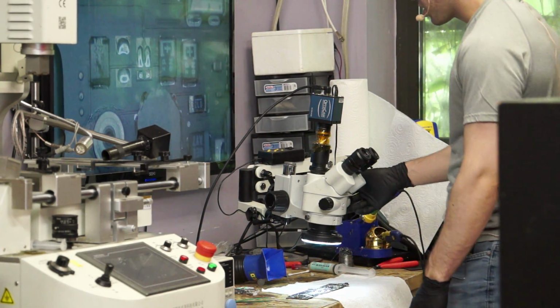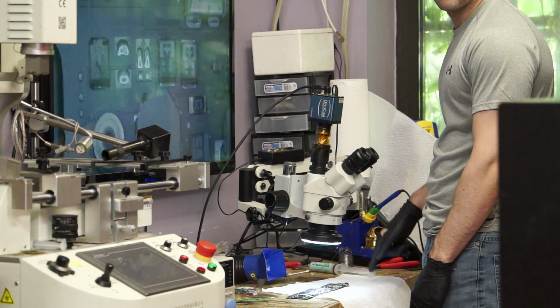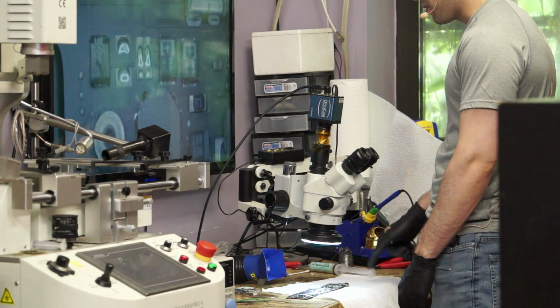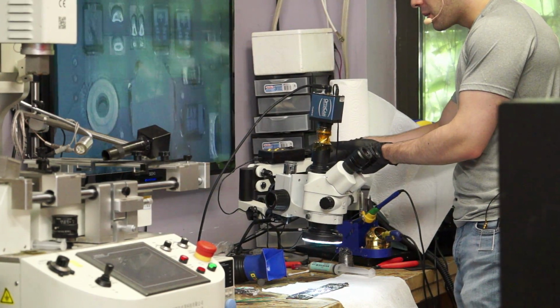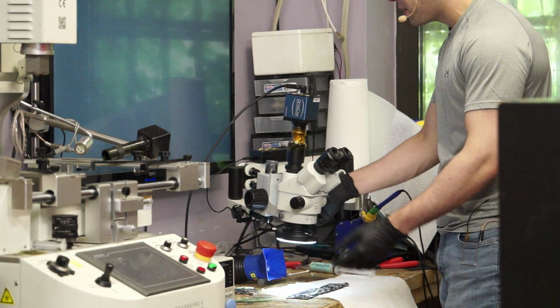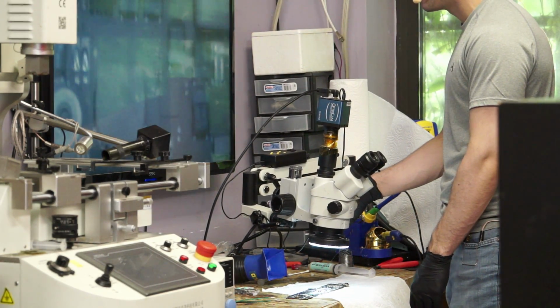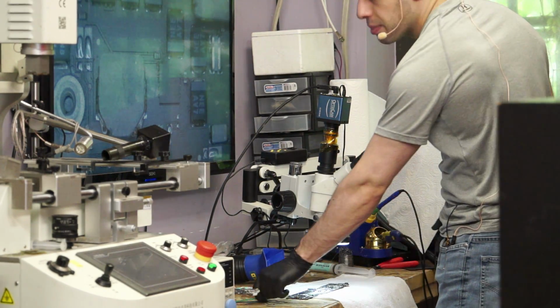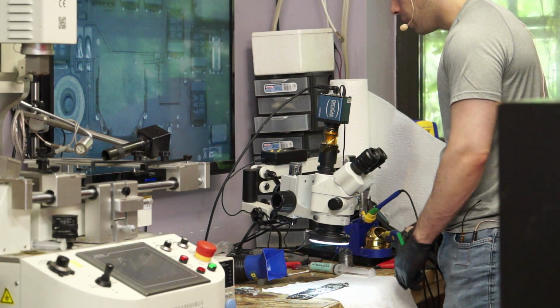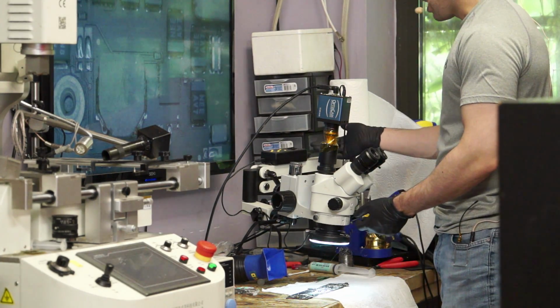But the issue with this is, again, you do this, it's very sensitive to any type of tapping, because it's set up to move freely. That winds up being its downfall. It's great because it's very flexible and easy to move around, but the fact that it's easy to move around means that when you pick up your tweezer, it will move around. When you lean your elbow on the table, it will move around. So this kind of drives me nuts.